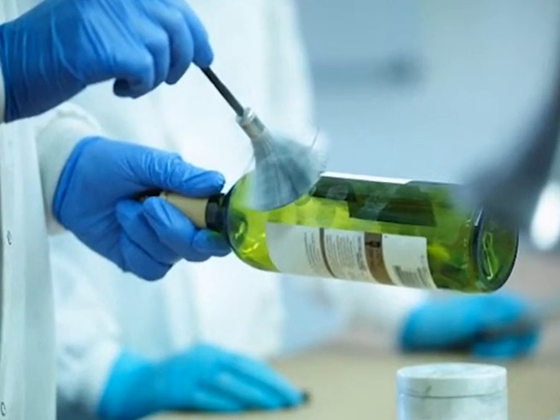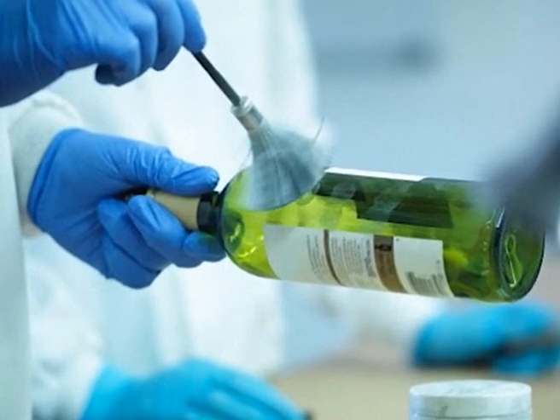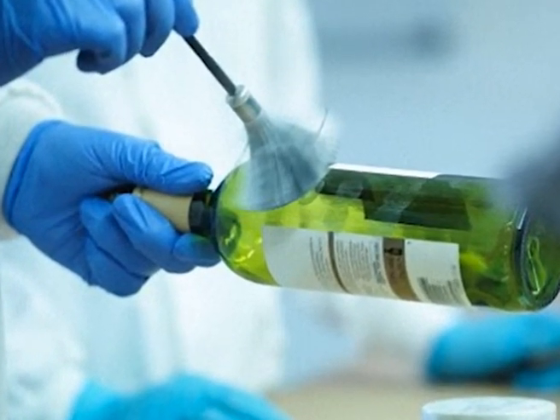Enzyme pretreatment method cannot be applied to routine samples. It requires a long developing time. It is unsuitable for field work. The technique may be tried out over articles bearing extremely weak fingerprints.